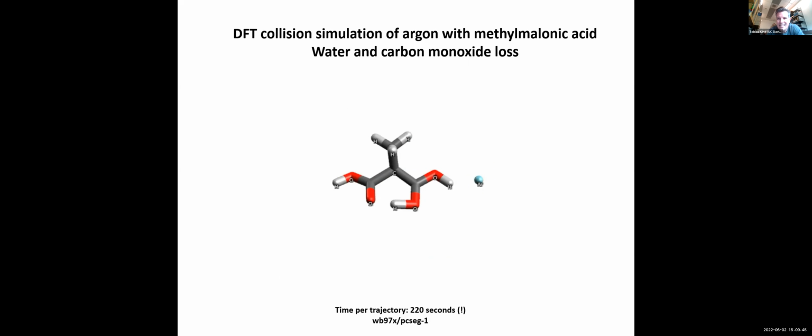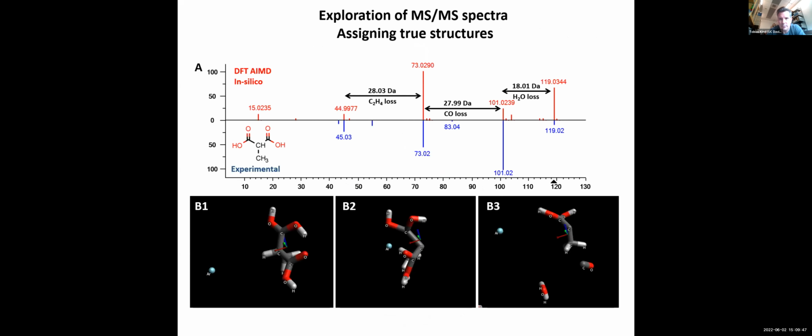We can have a look inside the mass spectrometer, and that is something really, really amazing. And we can use this knowledge, the fragmentation knowledge, not only for teaching purposes, but really for research. We see very clear our reactions here. We see water loss, CO loss, we have seen that, I showed you that, C2H4 loss, fragments that are very easy to explain.